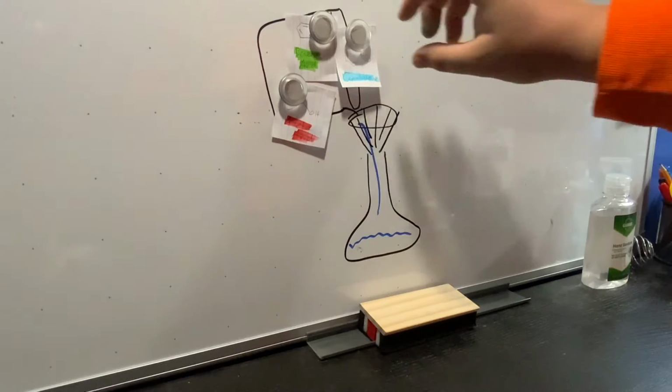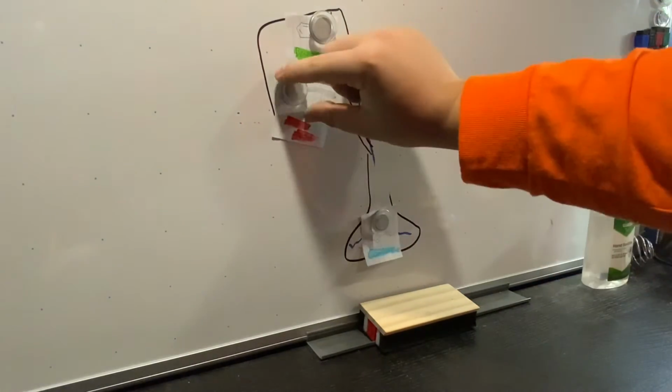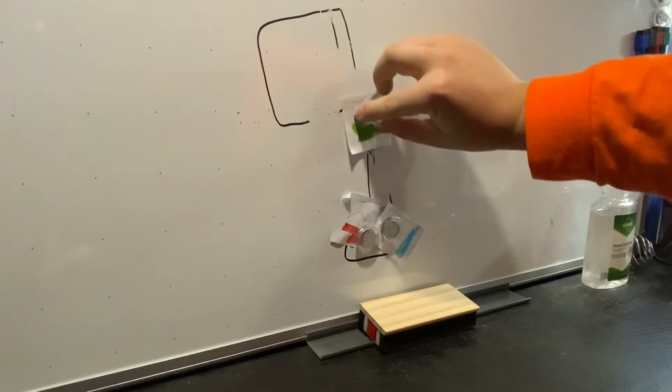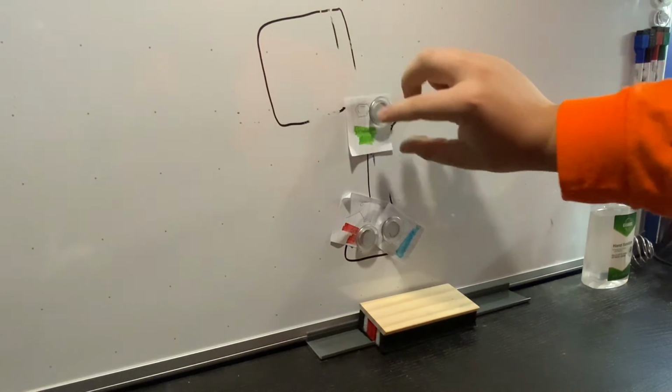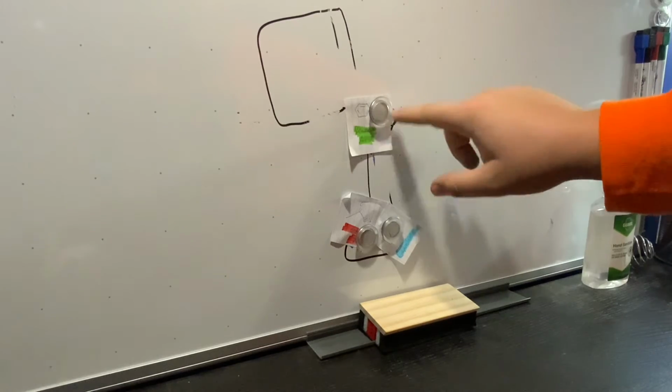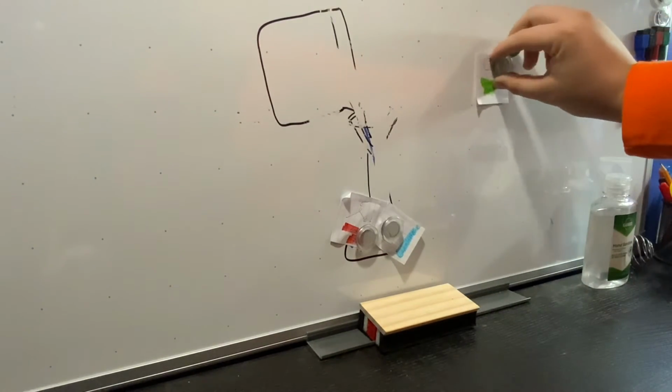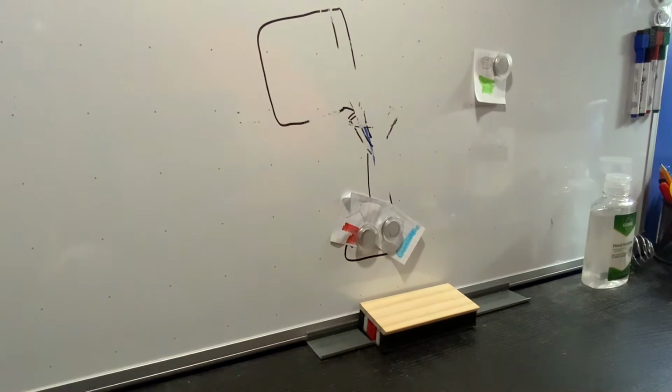So as we pour the solution through the filter, the caprolactone and the acetic acid will pass through the filter into the solution at the bottom of the Erlenmeyer flask, and the benzoic acid will be held in the filter at the top. So we can take the benzoic acid from the filter by folding it and pressing all the water out of it, and then it can be taken as a precipitate solid at the end of our procedure.